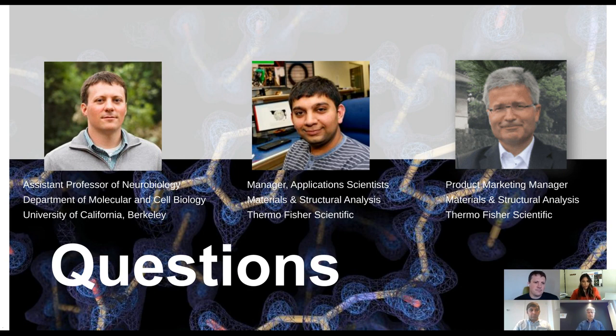Okay. And I think this is a specific question to your Task 2 project, Steve. Have you tried modulating different lipids for the nanodisc, such as lipids unique to the brain or other organs? Yeah, that's a great question. We have not yet. We'd be very interested in doing that, especially with the higher resolution structures now, where we can really make out what some of these interactions look like.